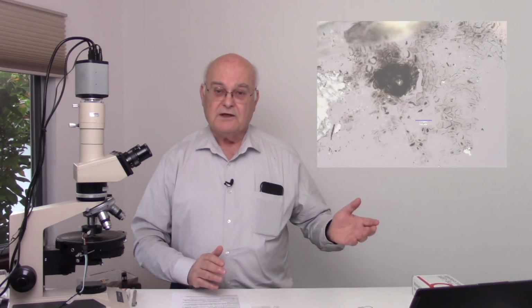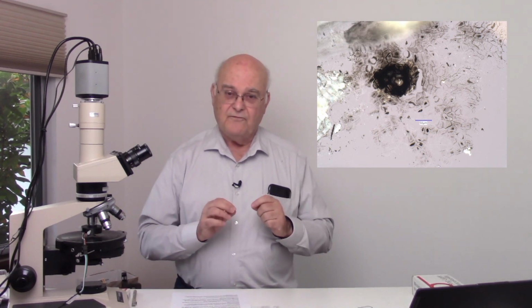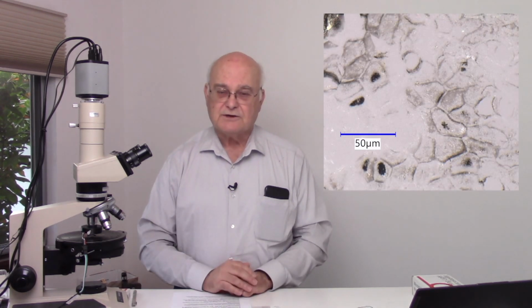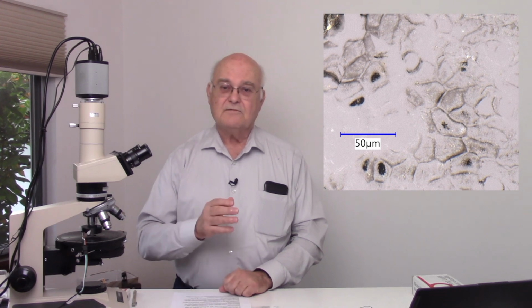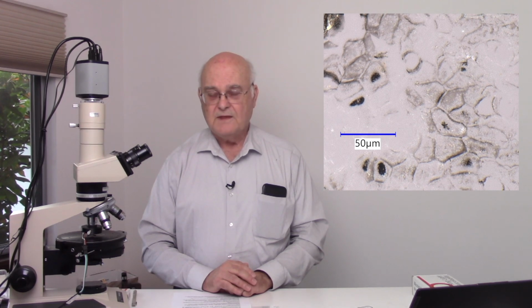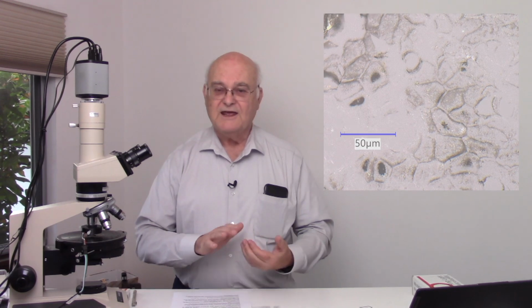There are many examples of the fragile structure of ash particles. As you can see, many of them are extremely fine, made up of very weakly attached individual particles. The pattern of their attachment is the cell structure. Anything that applies a force to that surface will destroy that structure. Tape lifts work because they actually bond the material in the adhesive on the tape.